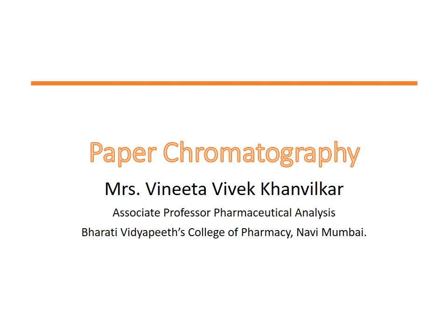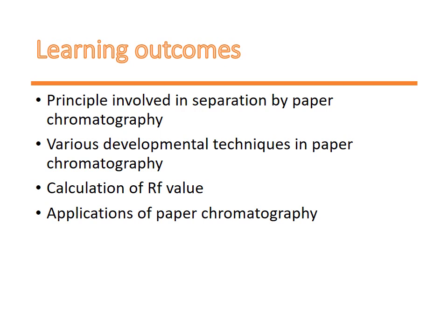Namaste. In this video, we will learn paper chromatography. At the end of the video, you will be able to explain the principle involved in the separation by paper chromatography, various developmental techniques that are used in paper chromatography, calculation of retention factor, that is RF value, and application of paper chromatography.